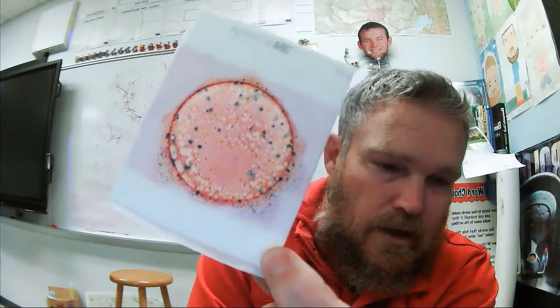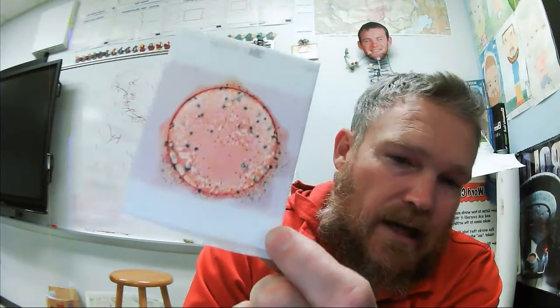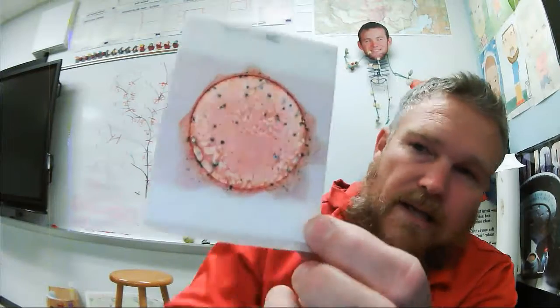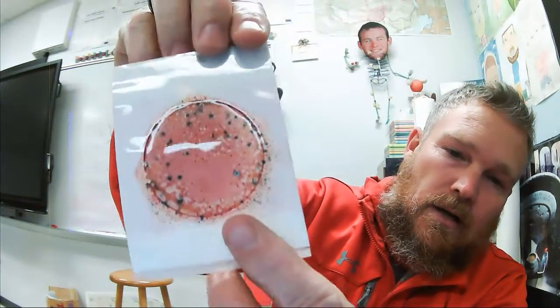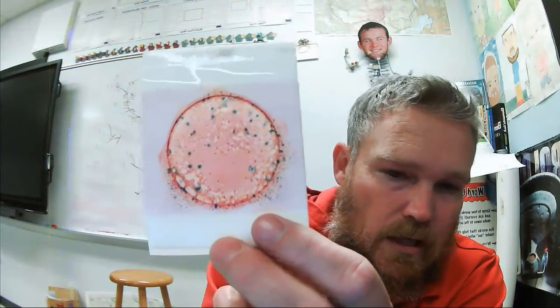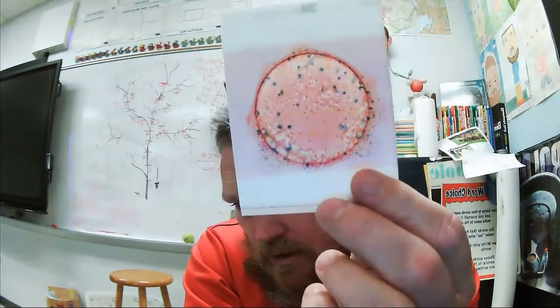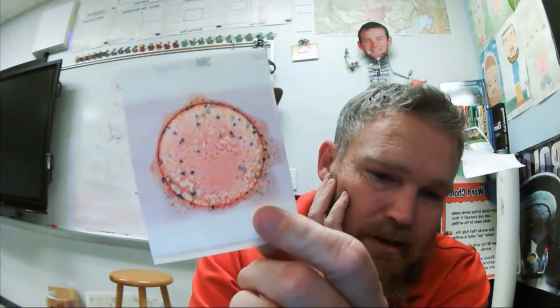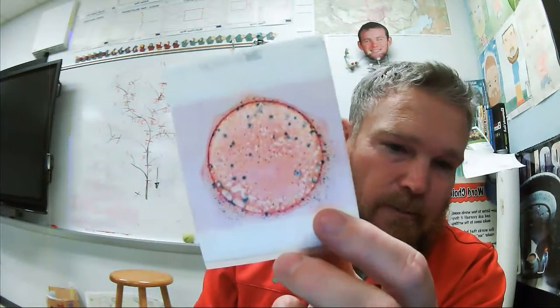We don't know if they're fecal coliforms for sure, but when they do show up on here, they are definitely coliforms. And on these plates, there's actually a way to count how many are on there, but those navy blue colonies are more than likely the kind of nasty bacteria that we're looking for that could make humans sick. So this is the kind that typically would be found in mammalian or human feces, so it might be E. coli. So what we're doing with this, first of all, you can get a count from that.